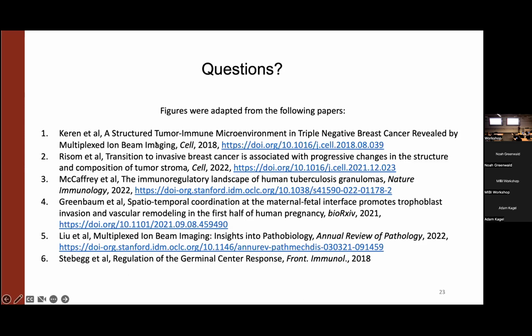And that kind of gets into some of the fun things to think about when you're trying to figure out the right way to ask some of these questions, is to really think about, logically, what makes sense when we're saying, let's randomize this to this, right? Is that actually recapitulating something that could possibly happen or not? And I think that's to Inna's point. That's why we're trying to lay out the high level concepts around these, because there's probably not hard and fast rules for all of it.